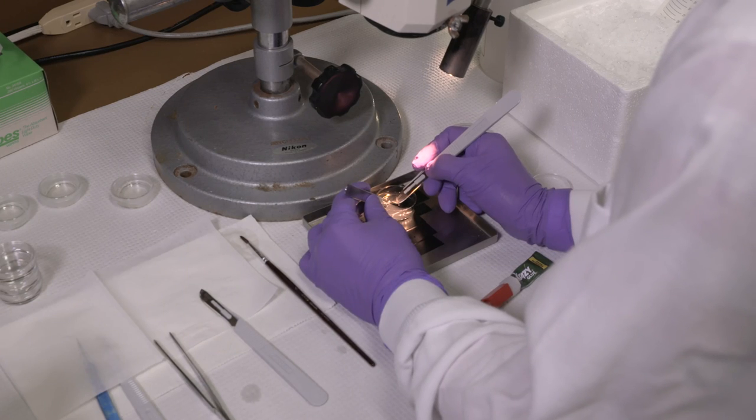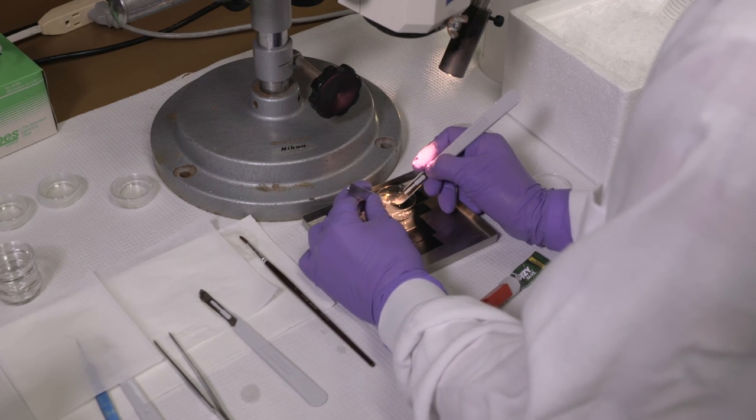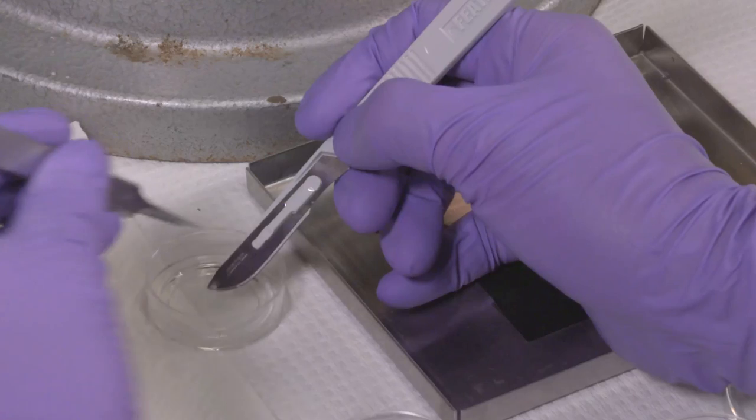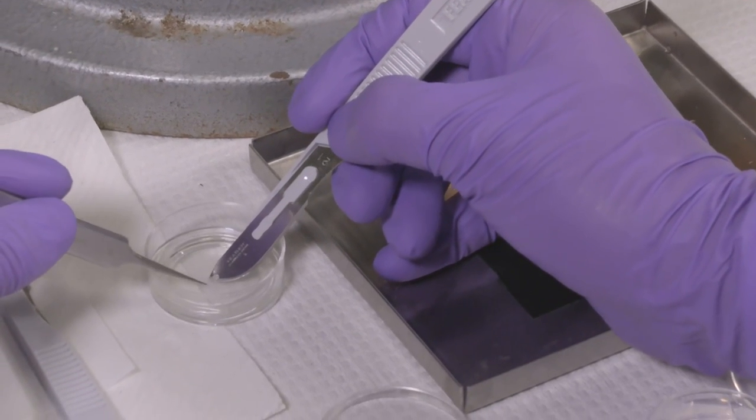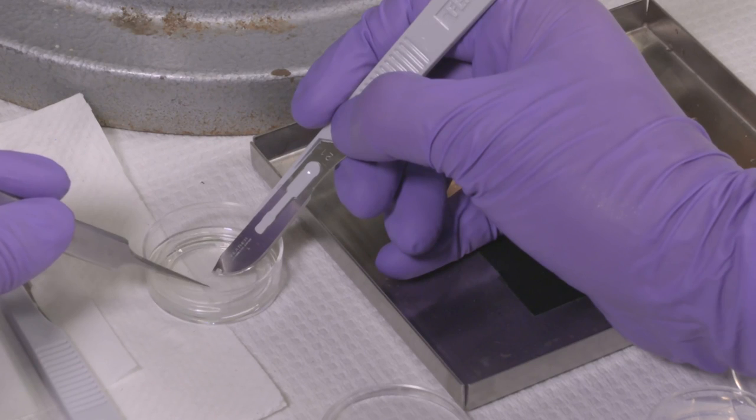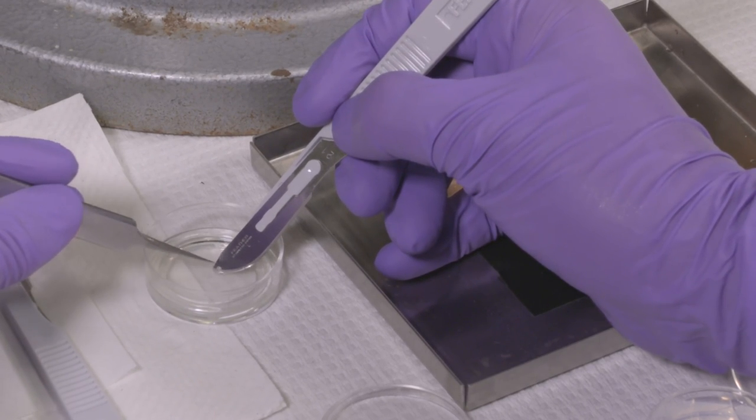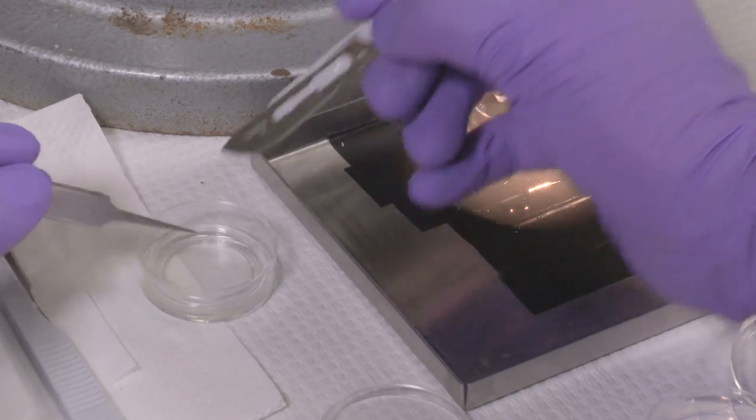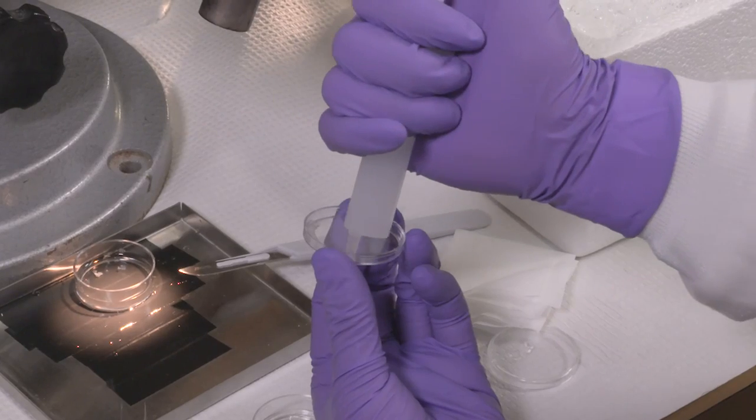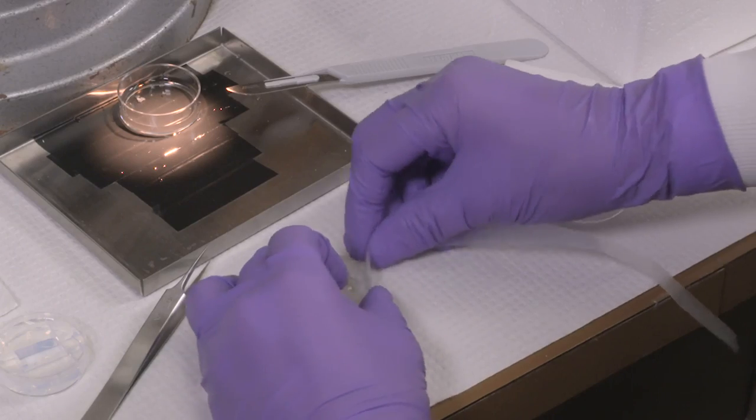The optic chiasm and SCN are trimmed with knives. The SCN slice is transferred onto a culture insert in a sterile petri dish with medium that contains luciferin. We seal the plane with grease and a parafilm.